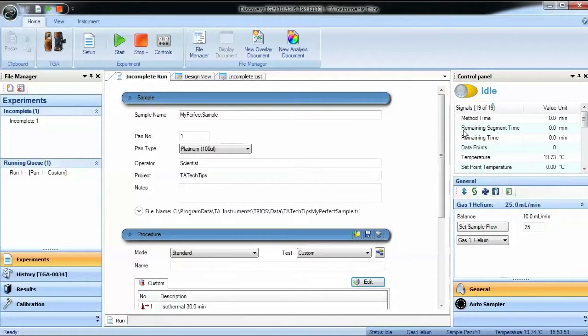When setting up a TGA experiment in Trios software, choose a pen type suitable for your application in the drop-down menu.